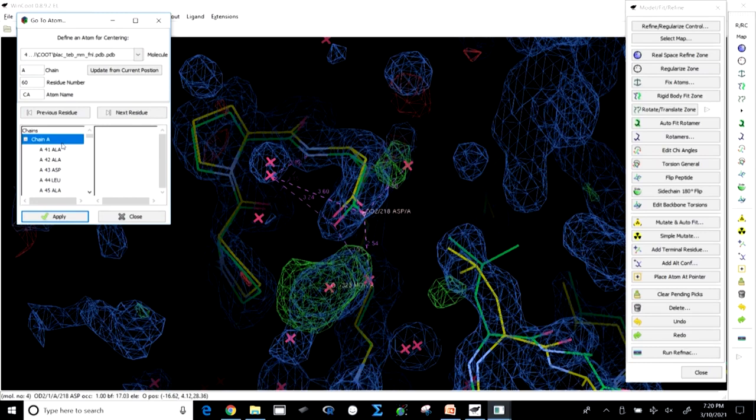So, it is difficult to solve them, or sometimes like here we ourselves cut out that portion, so that we make our overall protein more rigid. More rigid protein means more stable protein, more production of the protein.